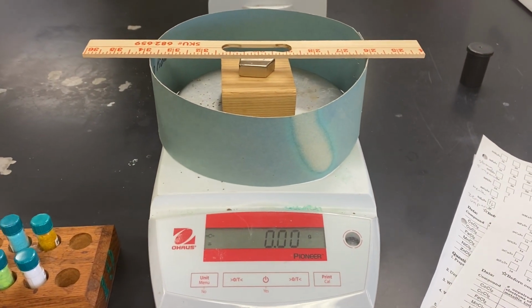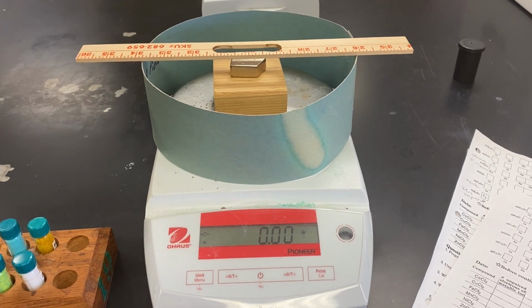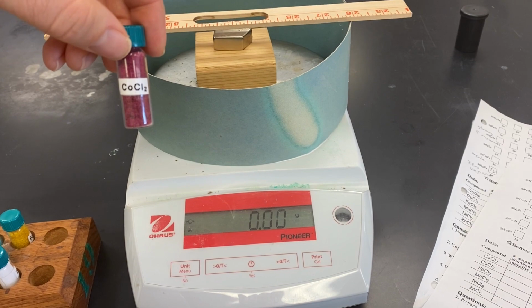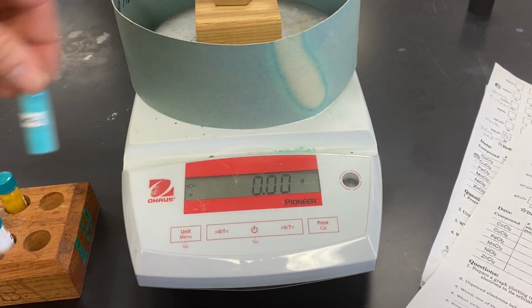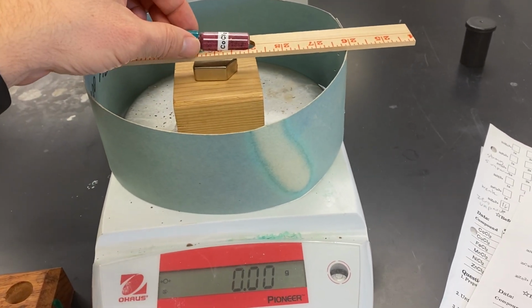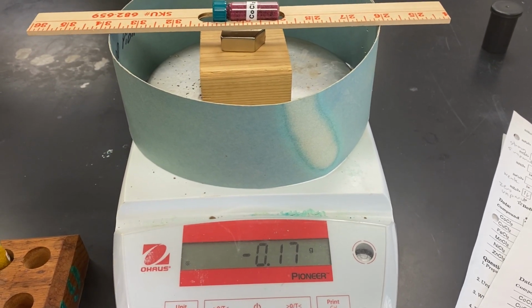So what I'm gonna do, I have these little vials right here, and I wanna take this vial. I'll explain in a second why those formulas on the different samples are important. But we're gonna take this right here and we're gonna put it ever so carefully, and it goes to a negative number right there, okay?